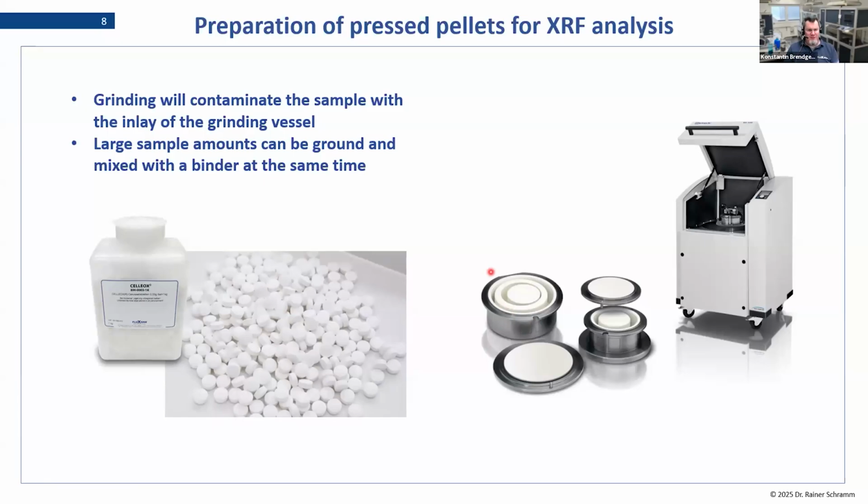There is this example of iron being a critical analyte when it comes to glass manufacturing, because it affects the glass. People who do glassware want to make sure that their silica carrier is extremely low in iron or has no iron at all. So if you're grinding that in an iron vessel, it gets a bit problematic.